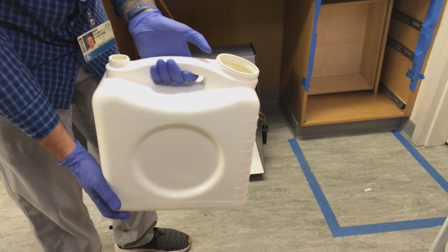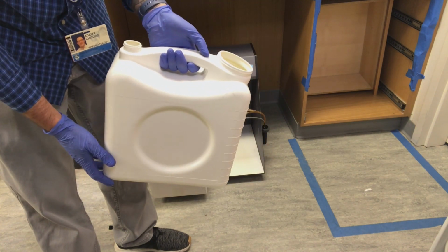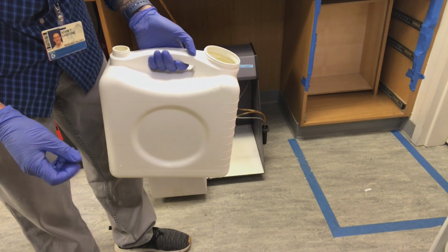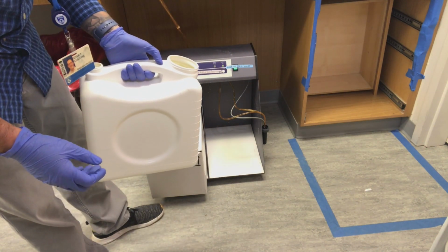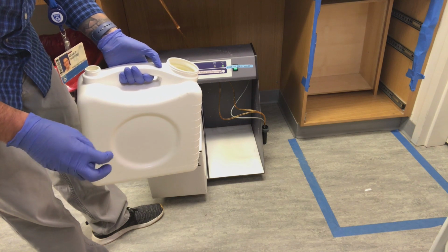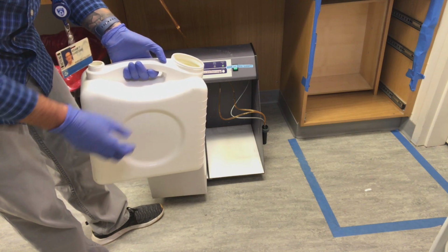You can then take this tank to the sink out in the hallway and dump it down the drain. Please make sure to run water as you're dumping this down the drain to dilute any of the bleach that's been in the tank.